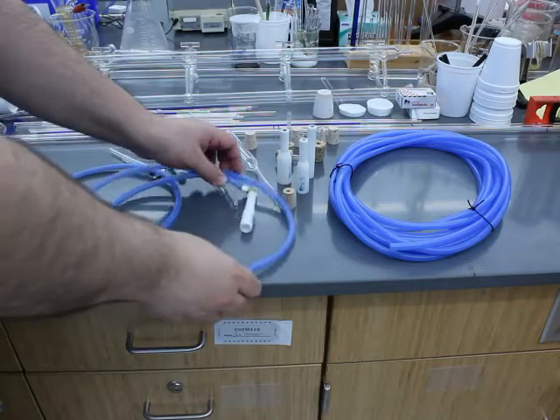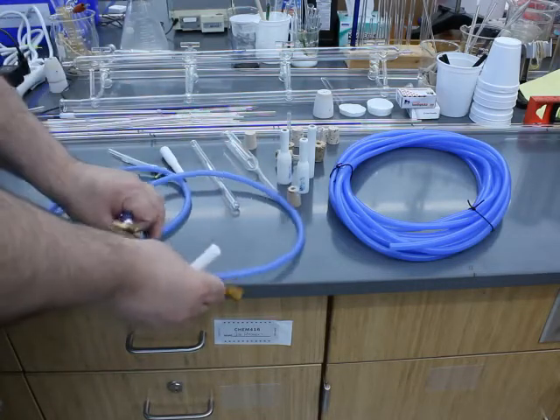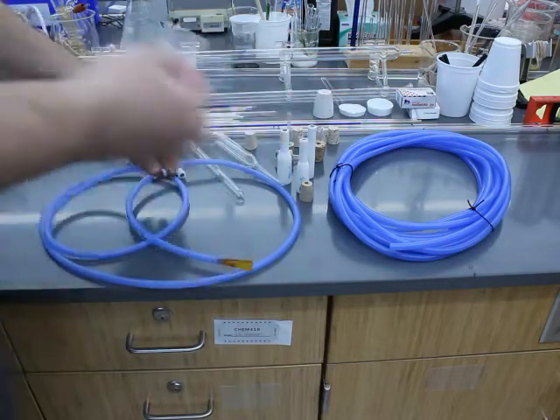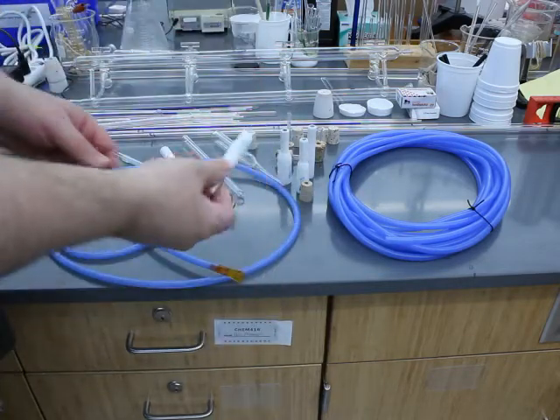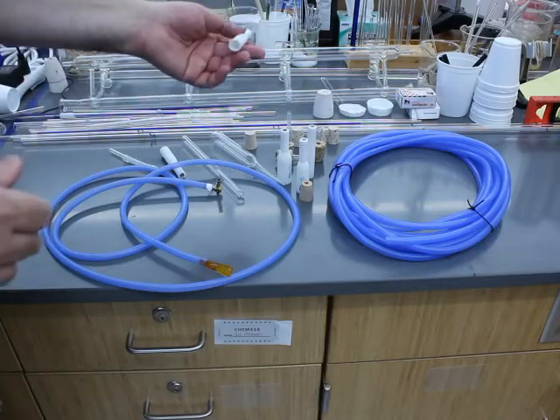All I wanted to do in this video was just show the basic equipment that you would need for a blow hose, a little mouthpiece, which you can buy. All of this, with the exception of the tubing itself, all of the silicone adapters and the swivels and the mouthpiece, I bought them all from Mountain Glass.